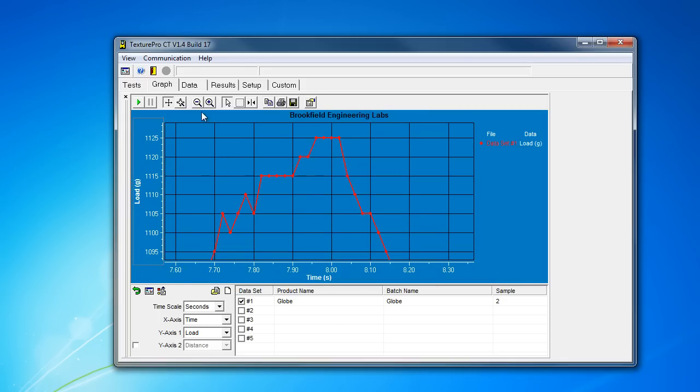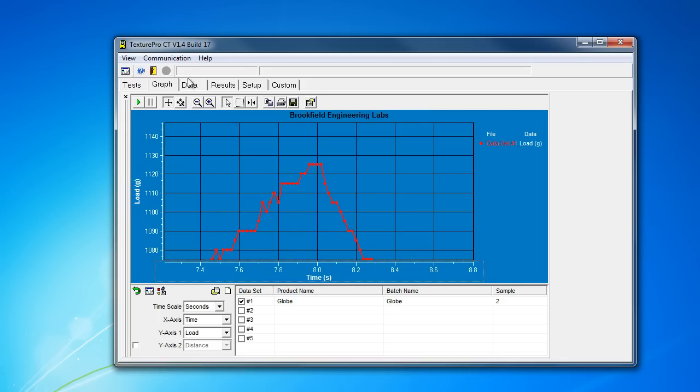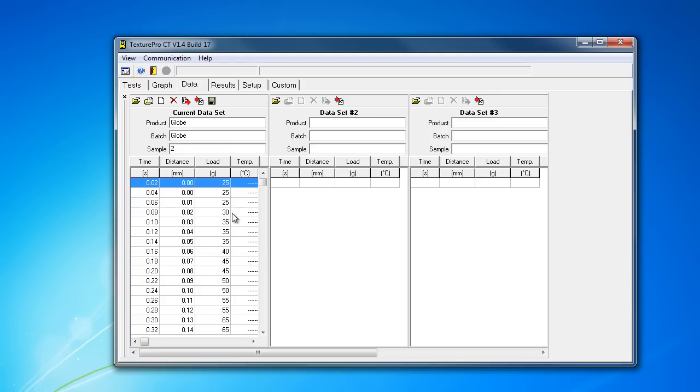One of the things I should note is that there's no way to unload data. For example, if you load up a couple data sets, the only way to unload some of those to make room for something new, because you've got a limit of only five data sets, is to close the program. And that will reset everything for you.